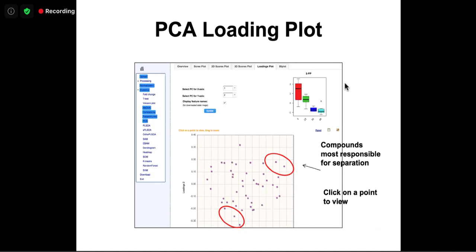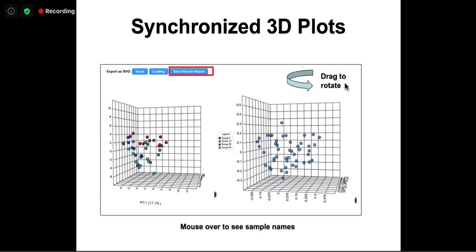So this is comforting. That's what I'm suggesting about multiple evidence pointing to a similar set of features. That's much more convincing. A lot of the time PCA tells you the same story as ANOVA, okay? Sometimes it's different, and you need to think about, hey, is that true or is it something else?